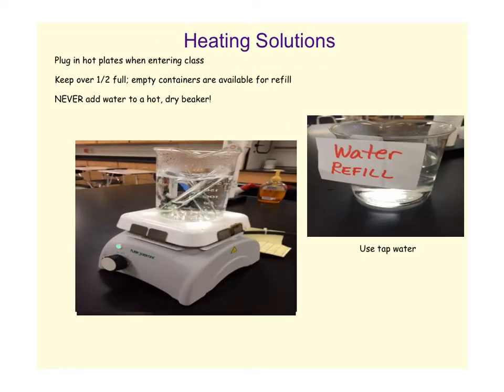Some steps are going to require you to heat your solutions in a hot water bath. Remember, you need to make sure that it's at least half full of water. There are water refill beakers near the sinks that you can refill them with. Tap water is totally fine. You don't ever want it to get all the way down, but if it does, turn the hot plate off, let the glassware cool all the way down before you refill it with water. You don't ever want to add water to a hot, dry beaker. It will shatter the beaker.